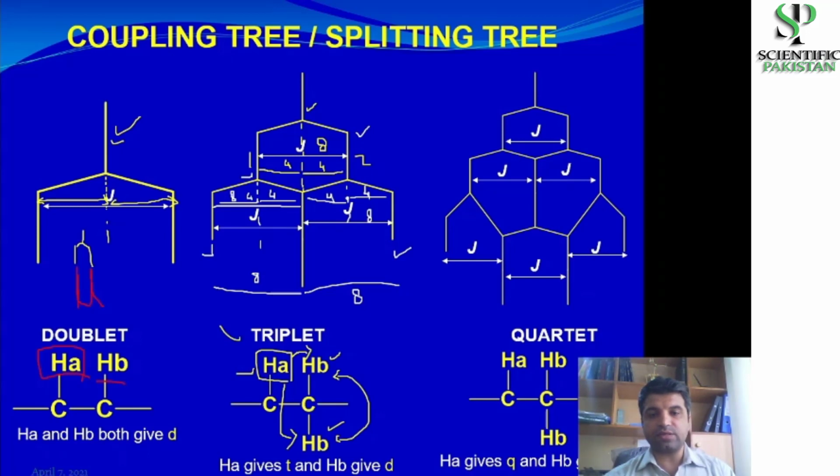And you saw that the distance from the center to this line is equal to 4, and the distance from the center to this line is equal to 4, and that is equal to 8 Hertz, exactly equal to this 8. Right? Now, to split this line into two, it has moved 4 Hertz to the right, and so it falls right in the center here.